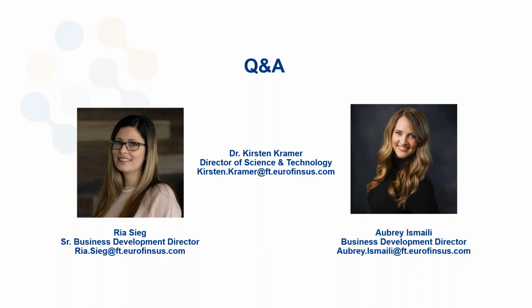All right, great, thank you. Okay, another question. Can you use one instrument for multiple product types like meal and oil? Hi, this is Aubrey. I can take this one. So a lot of the instrumentation, at least that QTA supports, has the ability to test varying sample types. So as I think the question asked was fish meal and fish oil. So we do have instrumentation that can support both product types. You do not have to have the same requested traits either. So each of those can be customized with the solutions we have.